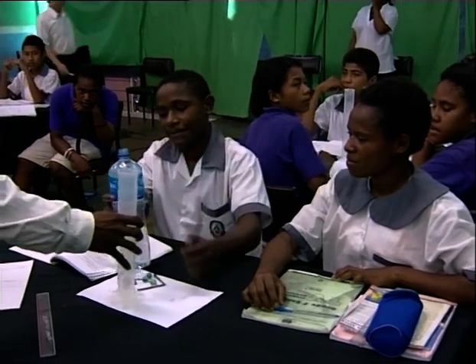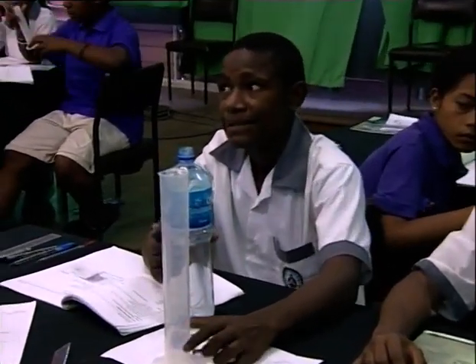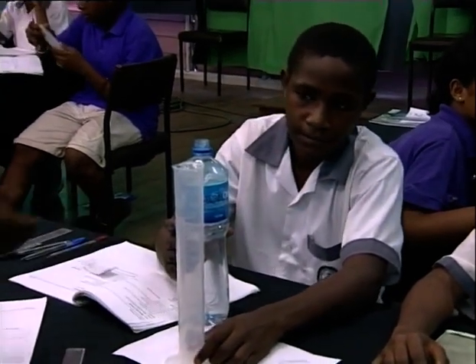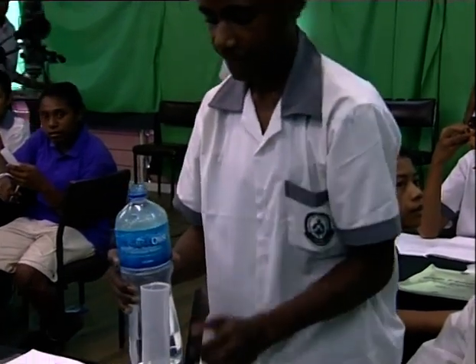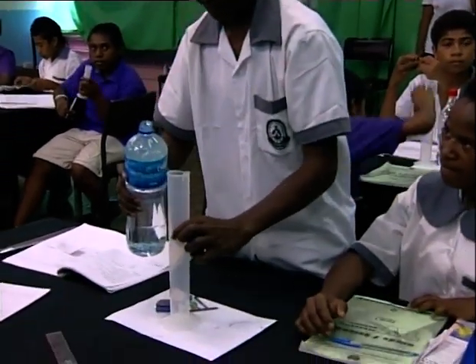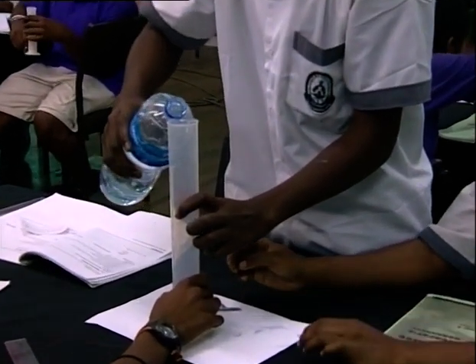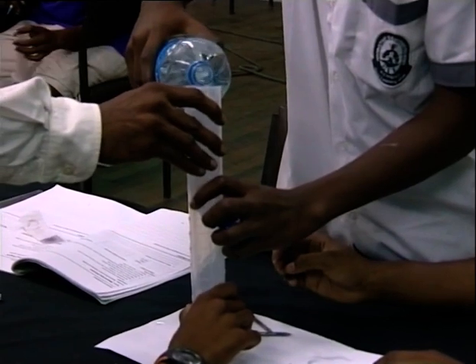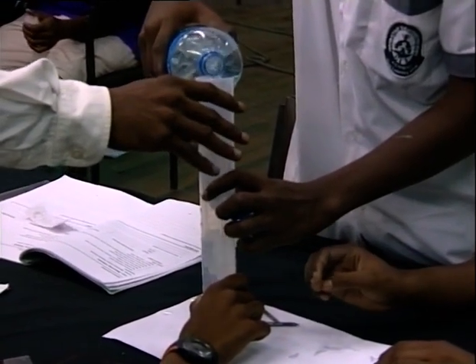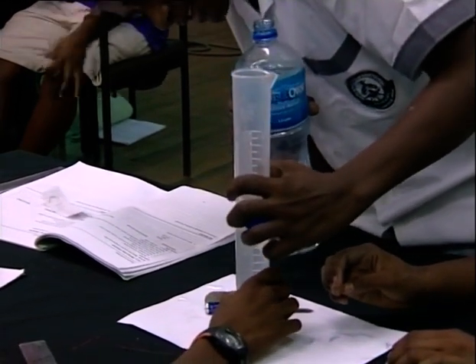Now when you want to fill, what must you do? Tilt it sideways so the water doesn't spill. So stand, please. Always stand. Okay. Help your friend tilt the measuring cylinder halfway. Tilt it halfway. Right, the water is filled.